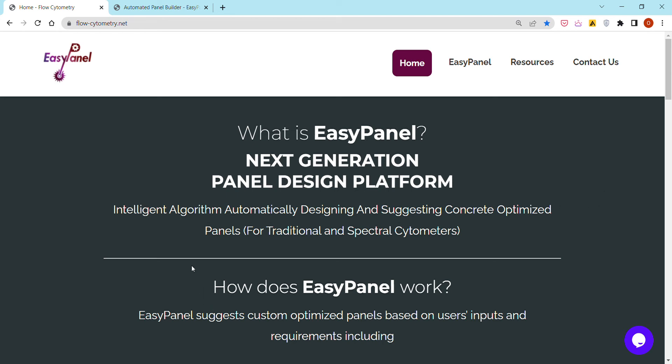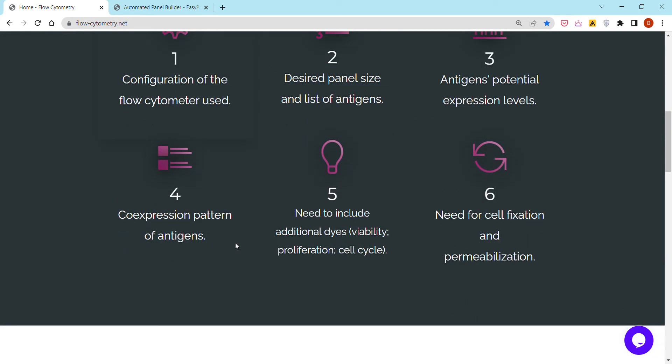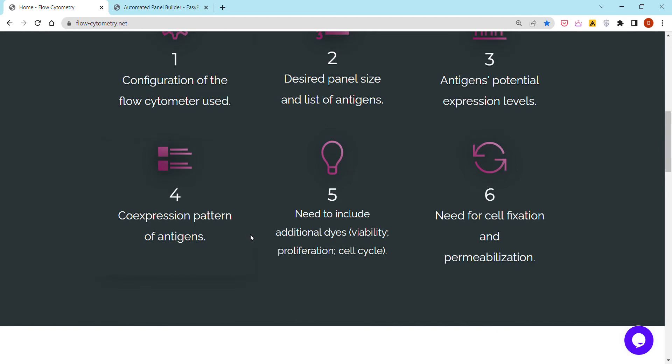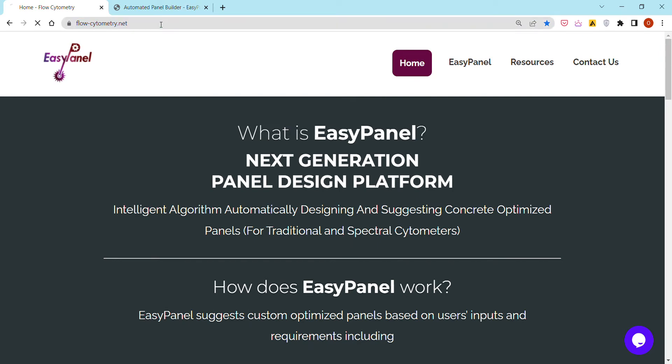Hello everyone, my name is Omar and I'm the co-founder of EasyPanel, which is an automated flow cytometry panel design platform that is available online on our website here, flow-cytometry.net.